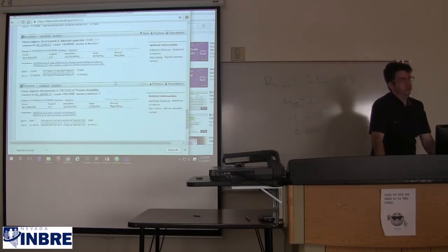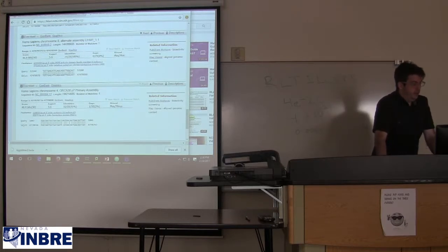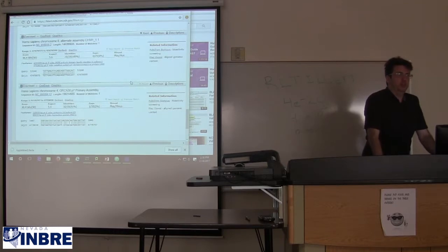So this is what noise looks like. This is what noisy, non-real results typically look like. Short, lots of gaps. It's not always true. There's 25 letters in a row. Poor e-values. And no biological hypothesis can match this. These phages don't infect mammals, so there's no real mechanism by which we can think that they would have acquired human sequence to be similar to.